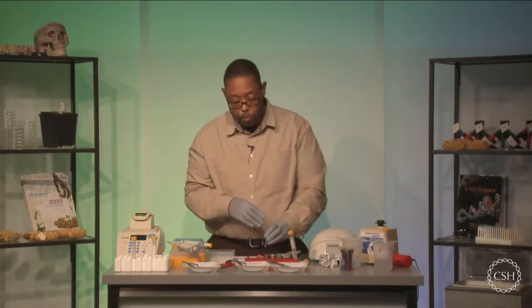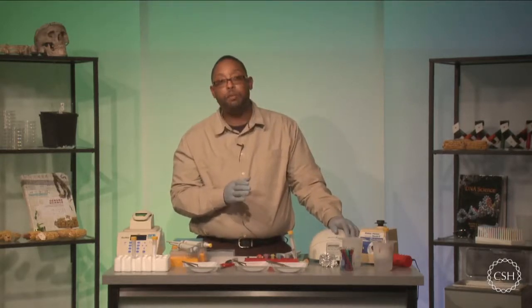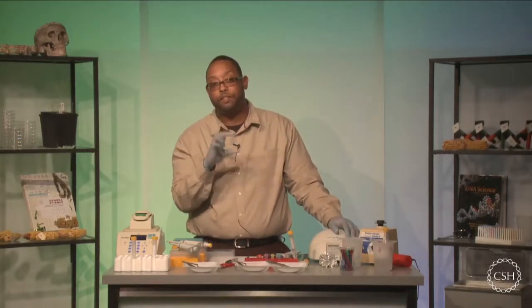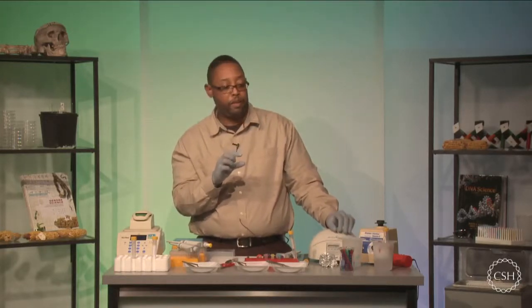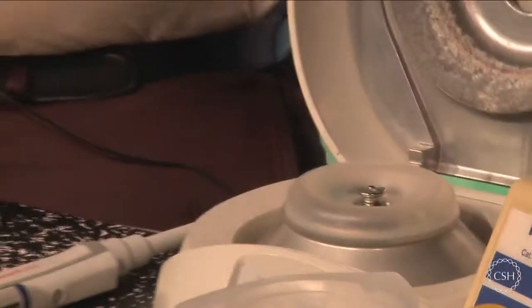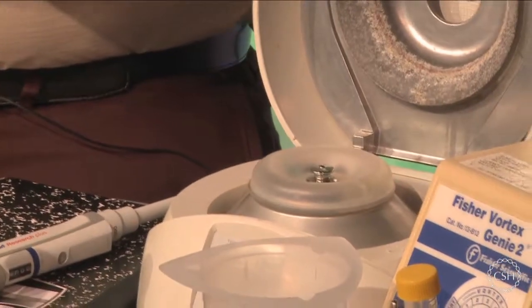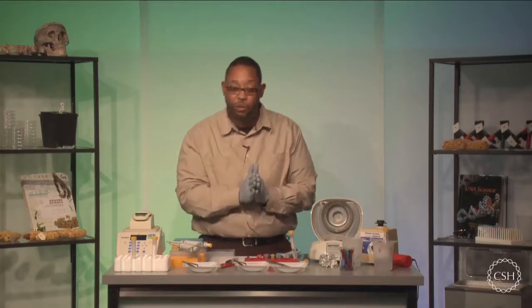Now once all of the debris is at the bottom of the test tube, we're going to be able to extract the supernatant, which is physically on top, and that's what we want. The rest of the test tube is actually ready for the trash bin. If you're worried that you might make a mistake along the way, always keep the remaining portion of the supernatant, because if you lose the first set, you'll always have a backup, since we're only going to use half of it.